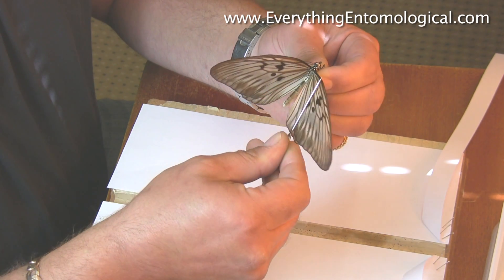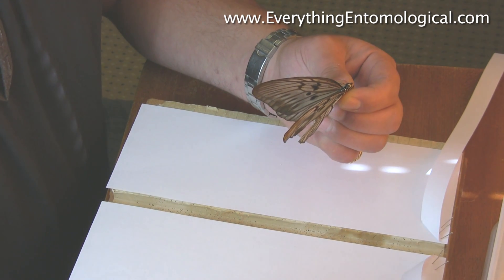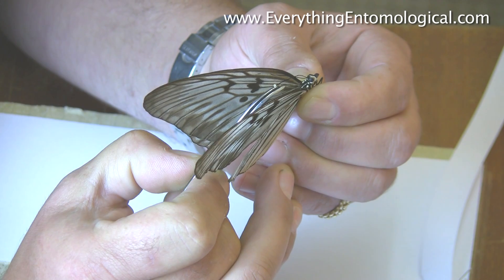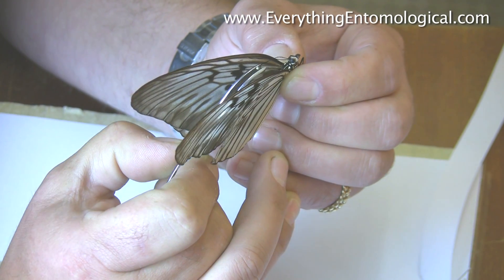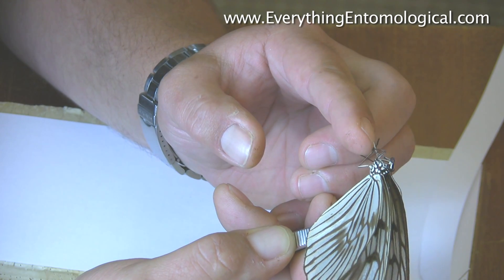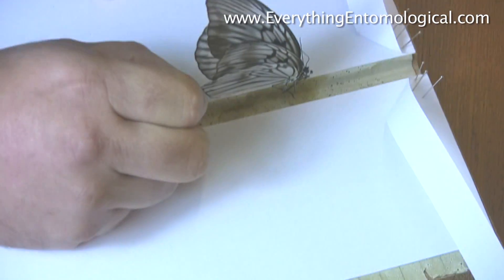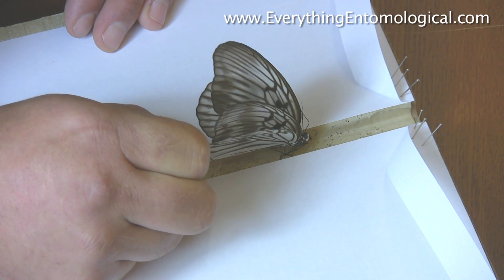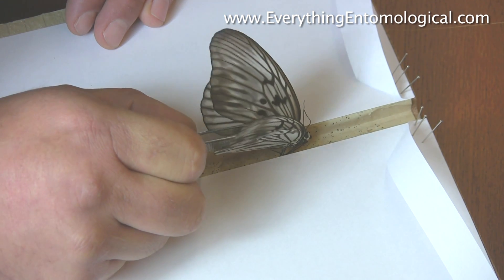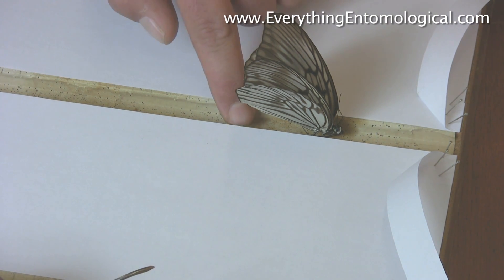Give it a nip, which makes the wings open as you can see — it's very pliable. Then get your tweezers, get your pin, and go straight through the thorax. Make sure the pin is nice and straight, push down so it comes through — there's your pin. Then put the specimen into the middle of the board and push down, making sure it's level and lined up in your groove.